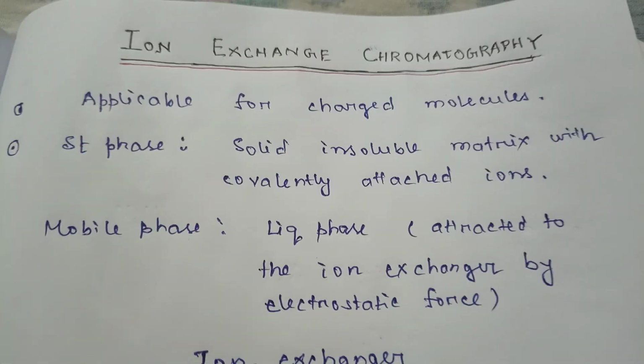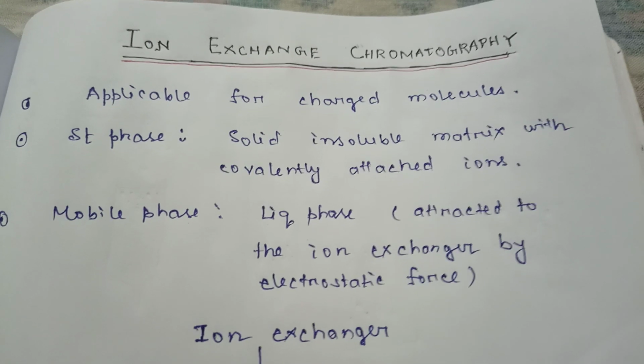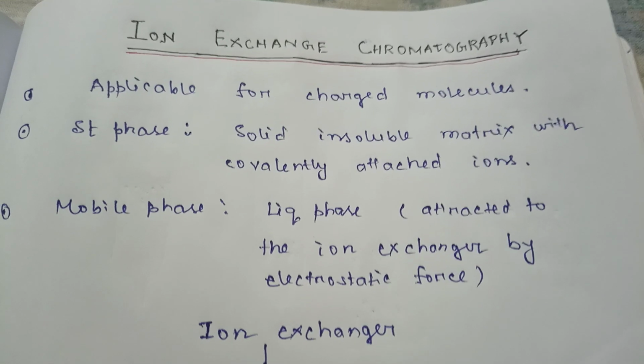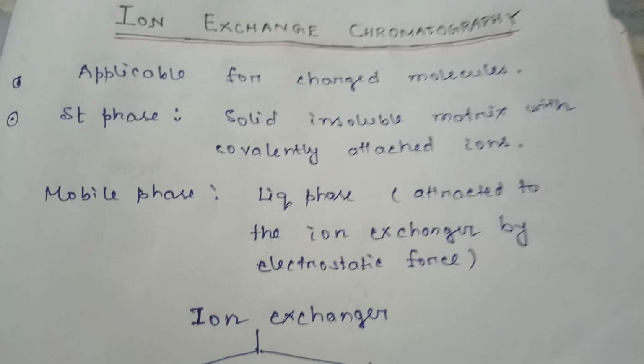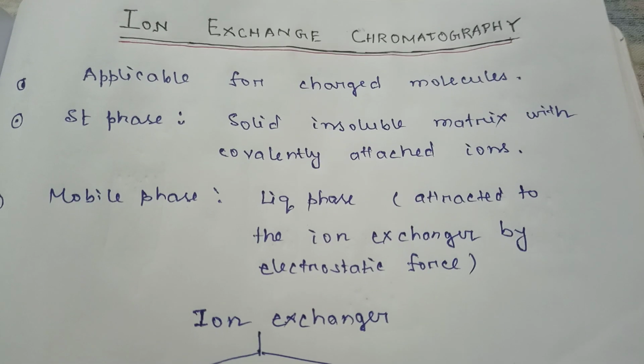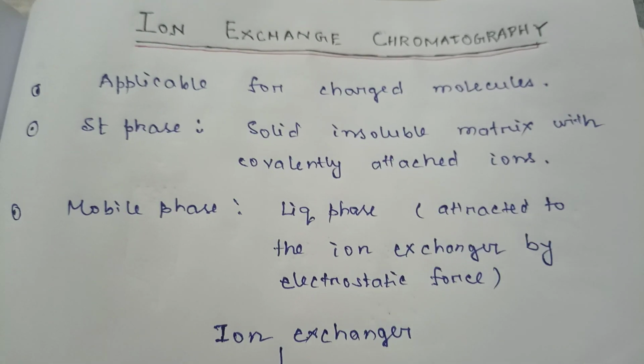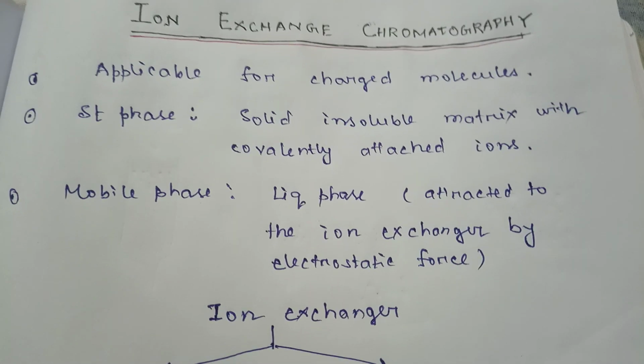Today we learn about ion exchange chromatography. So this is the new video of the chromatography series. Ion exchange chromatography is applicable for the separation of charged molecules. As the name suggests, ion means it will be charged, right?